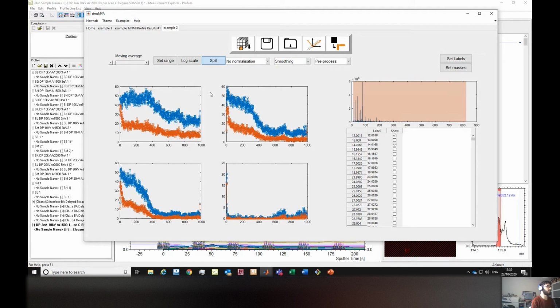Right. So I would do NMF again. So I will pause on scale. For this one, it works. I can either normalize by the same as I did before, or just leave it as is, because now these are not different data sets. It's coming exactly from the same data set. So as long as I use the same area, like the squares, it's the same level of noise, presumably the same kind of counts per second and all these things. So it's already comparable. You don't necessarily have to normalize.